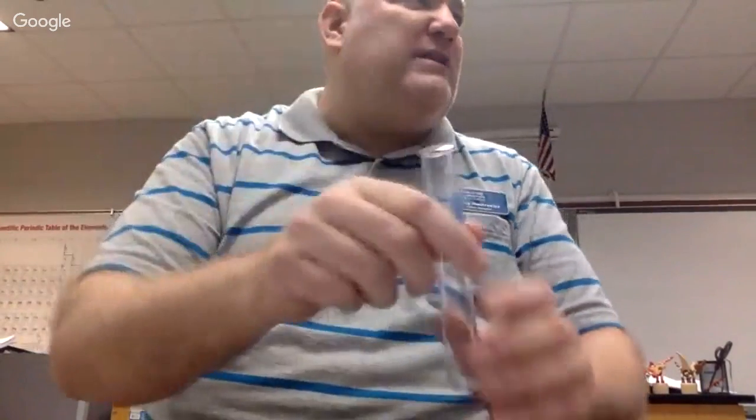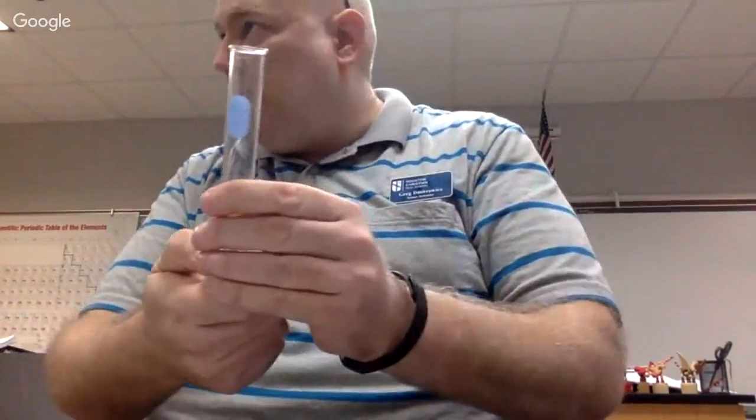But the lab still works perfectly, even if you don't get that pure color. Are you guys all with me on this? So after you've heated it, you'll either have it immediately turn and be like, oh, I am the greatest, or you'll be like, sad panda, it didn't change so much. Keep it in there for 2 or 3 minutes, pull it out, cool it down, take a look and see if you see specks of color like the other groups have, but your lab is still good.